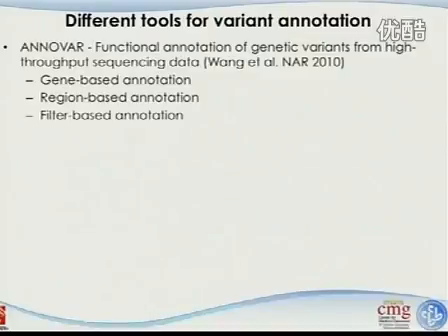And so the point of what I'm saying here is not really teaching you something new. Rather, when you read papers, you see they are considering different levels of filters: identified 40,000 variations, 38,000 of them are in the non-coding genome. Let's get rid of them. That's fine. And you still have 2,000 left. And of those 2,000, 1,000 are in the exon regions, and 50 of them are non-synonymous variations. Let's only focus on these 50 non-synonymous variations. And sometimes you are losing a lot of information. That is probably one of the reasons many of the disease people didn't find the genes that are there. And there are many different tools for variation annotation.